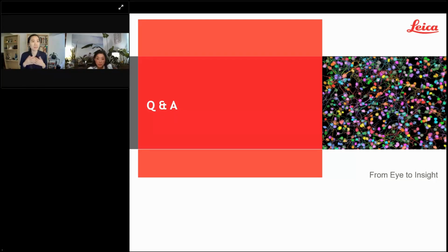The other thing to mention here, especially for the neuroscientist or anybody who's looking at potentially really unique cell shapes or cell shapes that are not round and globular, is that we're doing those distance measurements specifically surface to surface.